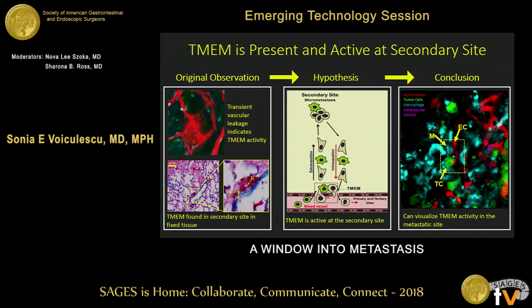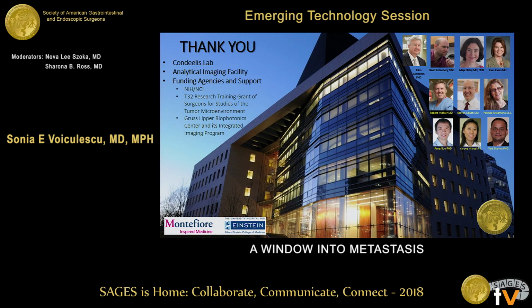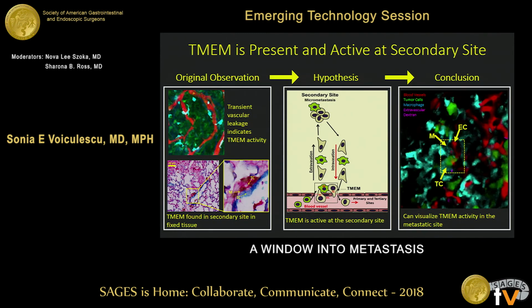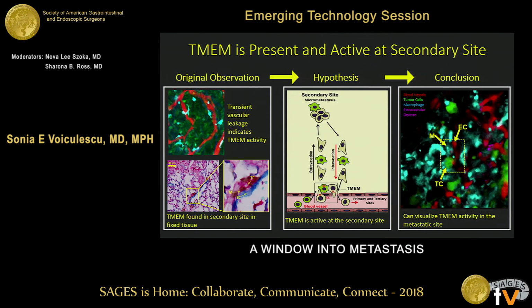And here in this video, you can see we've colored, sorry, can you just play the last video? Just put the cursor over it and play it. So you can see how this burst actually occurs. We've labeled the extravascular dextran in magenta, so you could see actually TMEM is active at the secondary site.